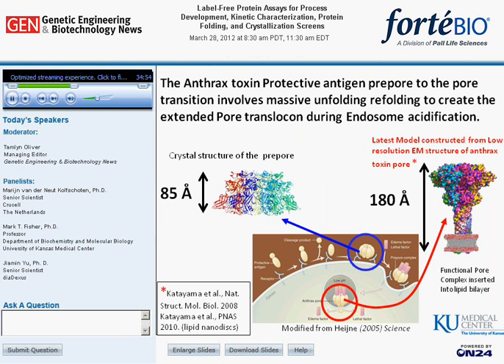In the last series of slides of this presentation, we also found that we could visualize large protein folding conformational changes that accompany the unfolding and refolding transitions of the anthrax toxin pore translocon using the ForteBio Layer Interferometry system. These latter examples have also been confirmed and extended using the newest single-channel ForteBio system called the BLItz. This slide simply illustrates the transition that we are examining.